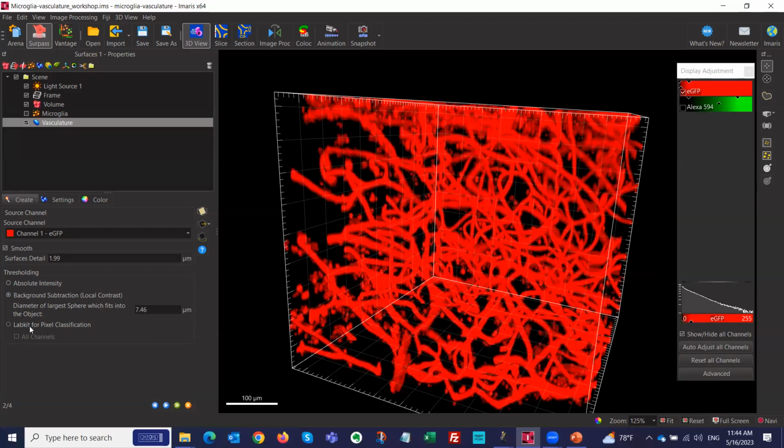This will help you for more difficult data sets to segment, and since we introduced it last year, this is what I use, I don't know, 80-90% of the time. So that includes the least amount of human bias. It gives typically the most accurate results, and it's also a quick way to get a good result for sure.